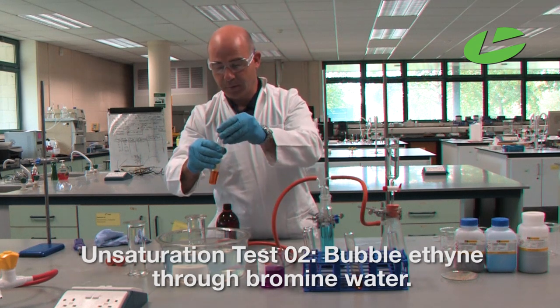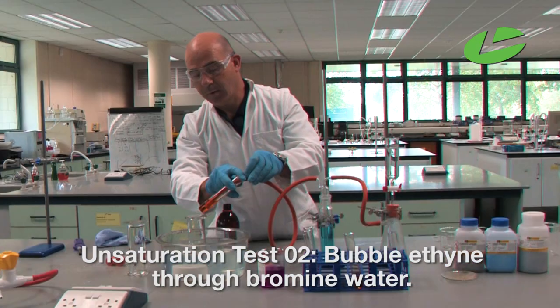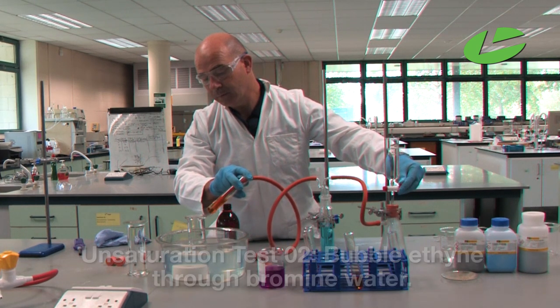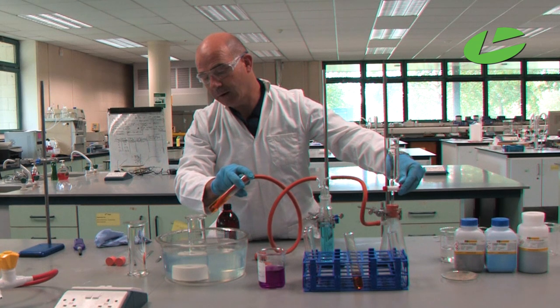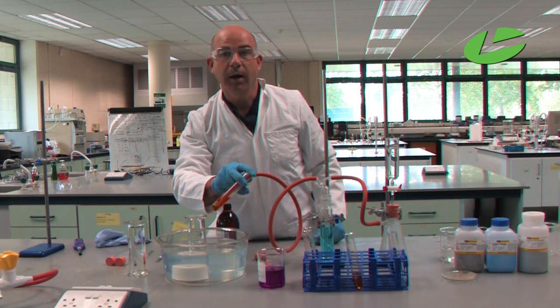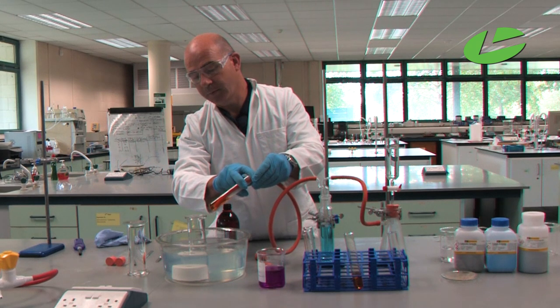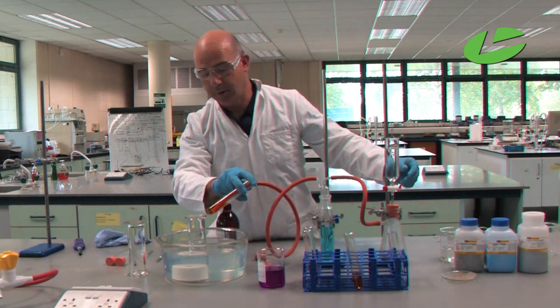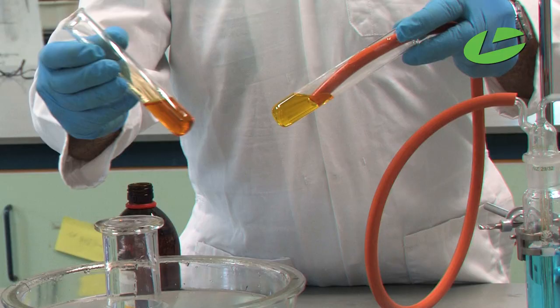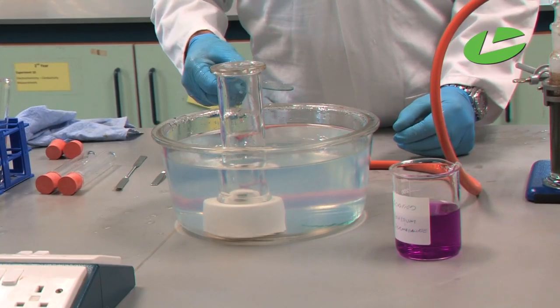Test two is the decolourisation of bromine water. I'm bubbling the ethyne gas through the bromine water. The reaction slows down so I need to add some more water. The bromine is adding across the triple bond, putting bromines onto the compound, which decolourises the solution. This takes a little bit longer, but as the reaction proceeds you can see the decolourisation occurring.